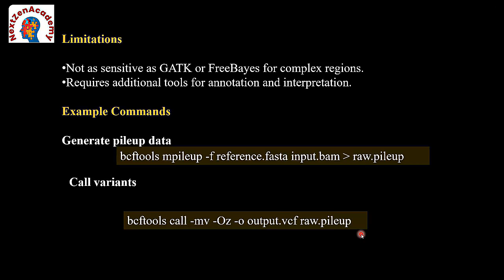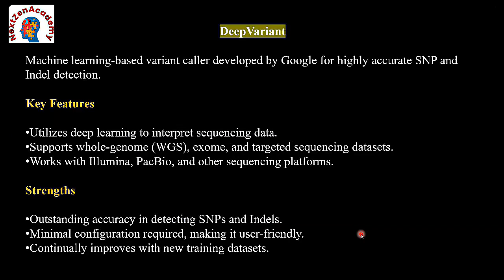What do we mean by SAMtools and VCFtools? SAMtools and VCFtools are also variant calling and variant manipulation tools. We can combine the read depth and quality metrics for SNPs and indels. It is integrated with BCFtools, for file manipulations like sorting.